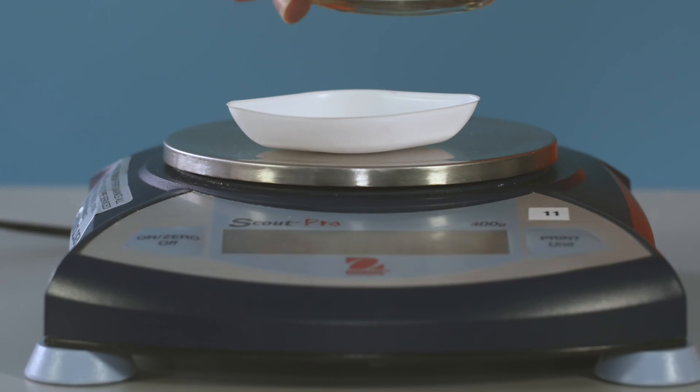To make up the standard solution, it's necessary to know accurately the exact mass of sodium carbonate which will be dissolved in a known volume of water. The best way to do this is via a method called weighing by difference. Using a spatula, measure out approximately 2.6 grams of anhydrous sodium carbonate.